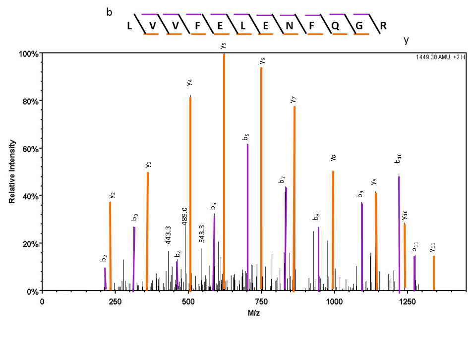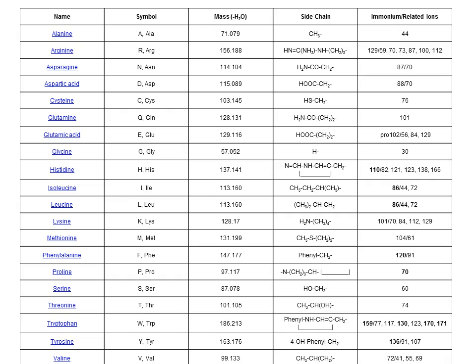What you'll notice, and the most important thing to notice here, is that all of the major peaks are explained. All of the major fragments should be labeled and explainable by the peptide sequence, and if they're not, something has been calculated wrong, or there is some kind of modification or loss that hasn't been accounted for. For instance, serine and threonine can lose water, and therefore you would find a major peak at 18 Daltons less than what you would expect. And these are the masses of the amino acids that we can use to determine our sequence.